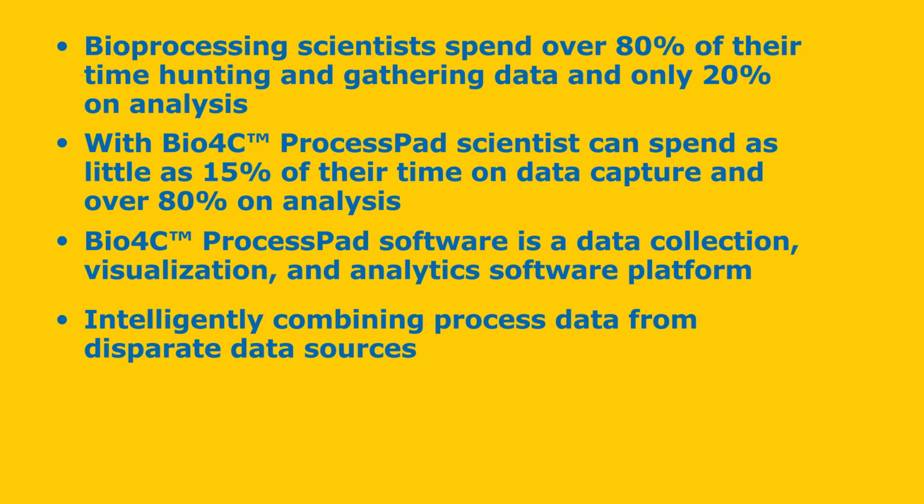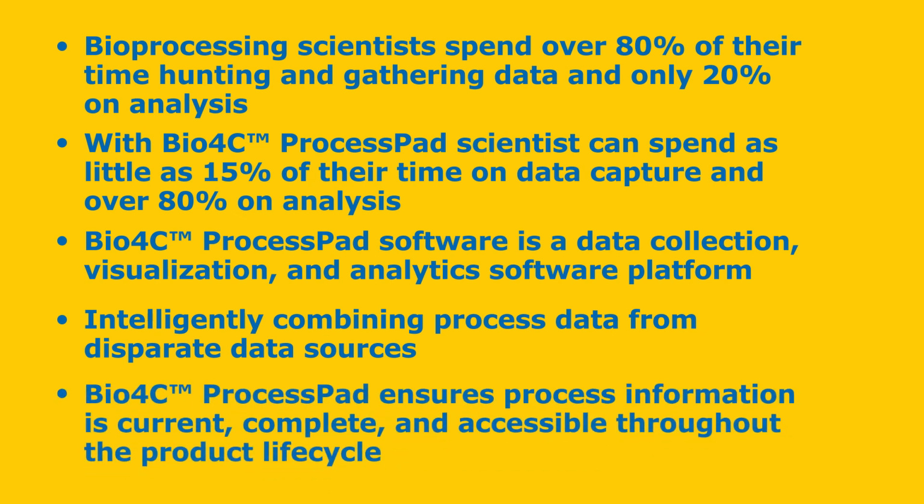Intelligently combining process data from disparate data sources such as batch records, quality control results, standard databases, QMS, MES, LIMS, and data historians into a single contextual integrated data source. Bio4C ProcessPad ensures process information is current, complete, and accessible throughout the product lifecycle. The out-of-the-box data visualization and analysis tools mean users don't need to be data scientists to understand, explore, and analyze their data.